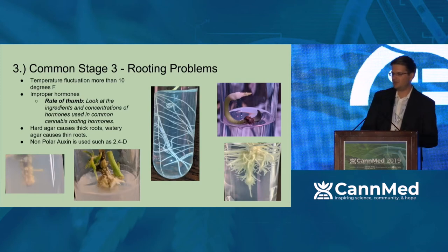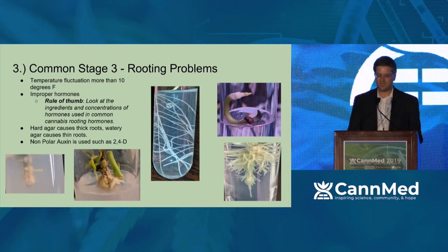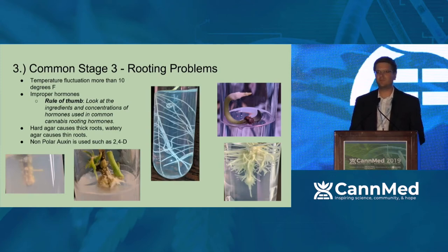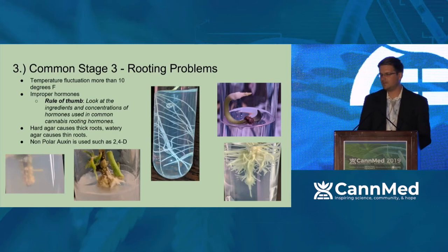I do also need to mention the previous media has a big role in your next successive stage. If you have too much cytokinin buildup from stage two or multiplication media, your stage three media will have residual and you're going to form more callus than you will roots. Ask me why, I don't really know, but that was just something that I saw, along with nonpolar auxins.